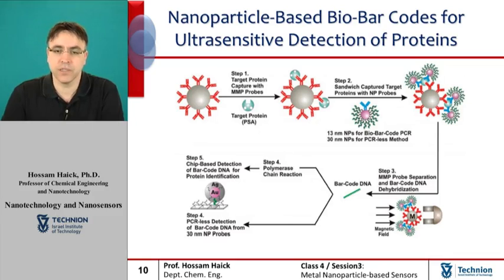In this configuration, magnetic separation of the complex probes and target is followed by dehybridization of the DNA on the nanoparticle probe surface, thus allowing one to determine the presence of the target proteins by identifying the DNA sequence released from the nanoparticle probe.